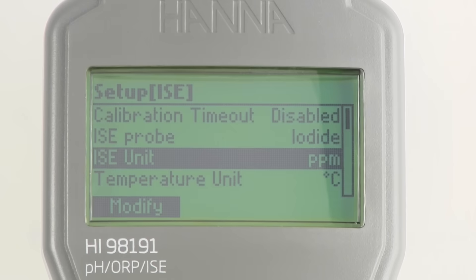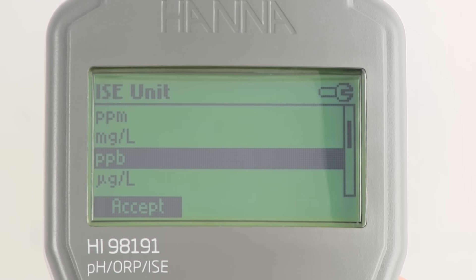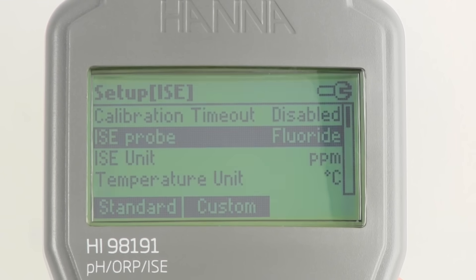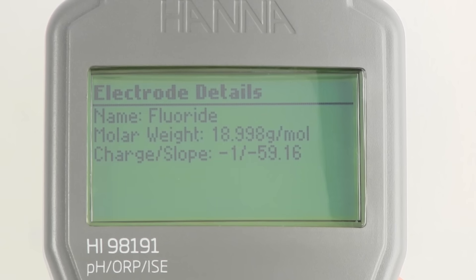The HI-98191 offers the ability to use ion-selective electrodes and have the concentration displayed in a choice of predefined concentration units including parts per thousand, parts per million, parts per billion, molarity, percent weight by volume, and more, as well as user-defined units. By selecting the appropriate ISE in the ISE setup menu, the appropriate ion charge and ion molar weight are applied to display ISE slope percentage.